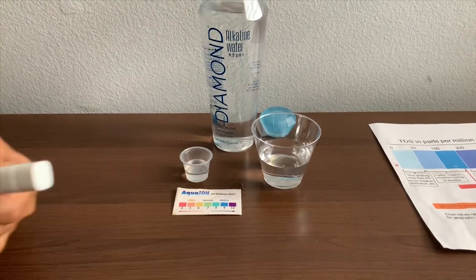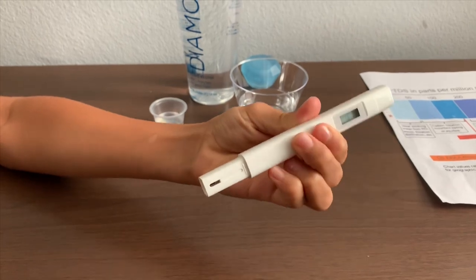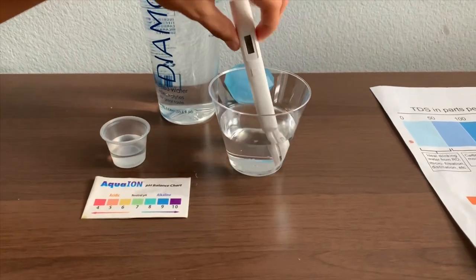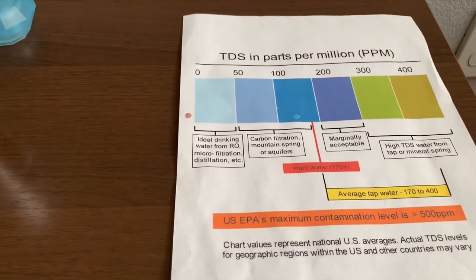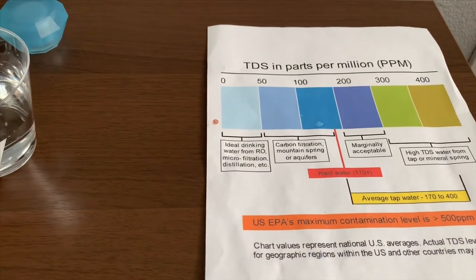First, we're going to test the TDS level. If you want to buy this TDS tester, check the link down below. Turn on the TDS tester and make sure it says 0. Put it in and let's wait. 32. That is micro filtered water.